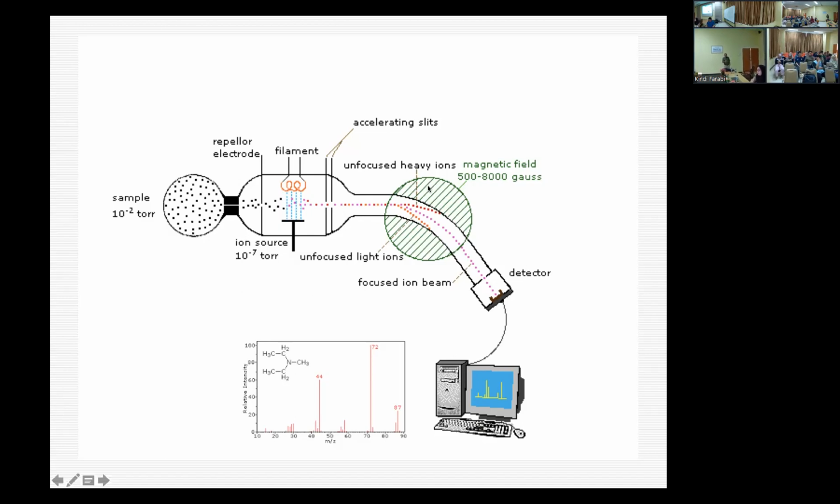Kita sudah tahu dalam kuliah elusidasi struktur, yang disebut aturan nitrogen: kalau ada nitrogen, pasti berat molekulnya ganjil. Kita sudah mengetahui, kalau mengandung nitrogen, berat molekulnya ganjil. Jadi ada yang disebut aturan elektron genap. Ingat nggak? Di kuliah dulu. Nah, ini termasuk hitungannya.